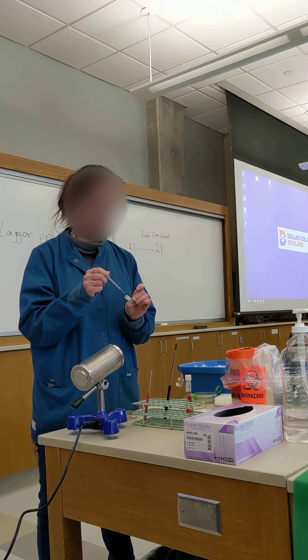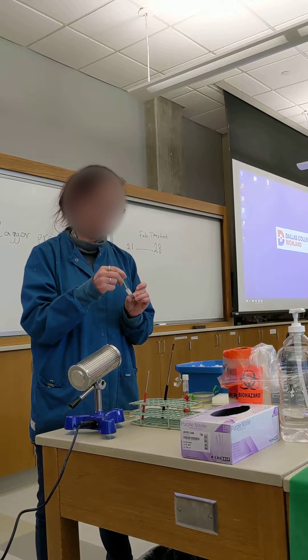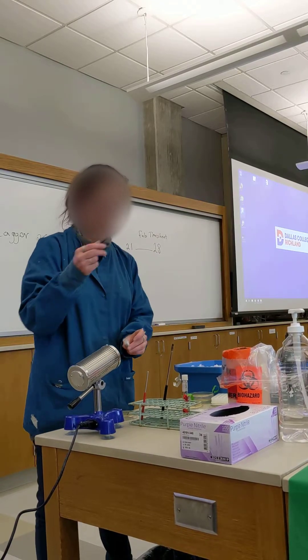Depress your bulb before you go into the solution. Go all the way down and suck out all of that proprietary fluid that they won't tell you what it is. It goes into your biohazard.